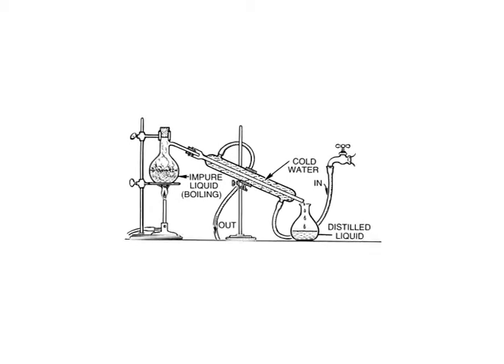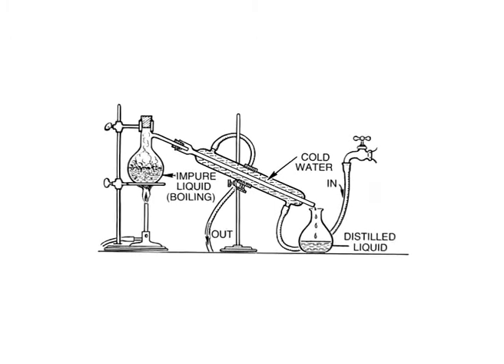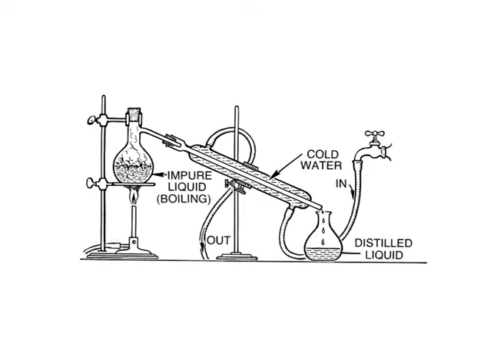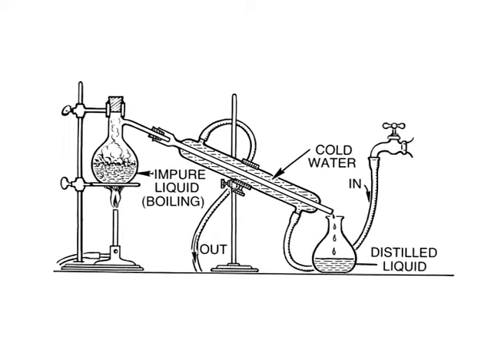The distillation procedure separates two or more liquid constituents in a given mixture solution based on the principle of relative volatility or boiling points. So, for sake of clarity, let us now know how volatility and boiling point are defined.